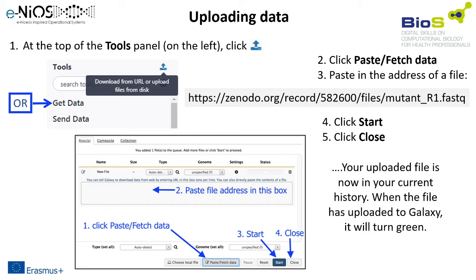In case of large files, larger than 100 megabytes, it's recommended to upload data from the Galaxy FTP server using an FTP client. Furthermore, Galaxy can import data directly from many public online repositories, such as UCSC browser, Ensembl browser, NCBI, EBI, specialized databases like FlyMine, WormBase, MouseMine, and many more by choosing the database of your interest from the Get Data menu of tools.